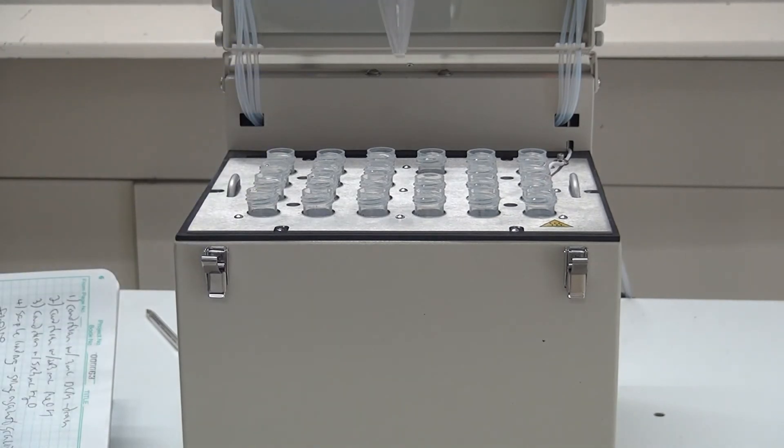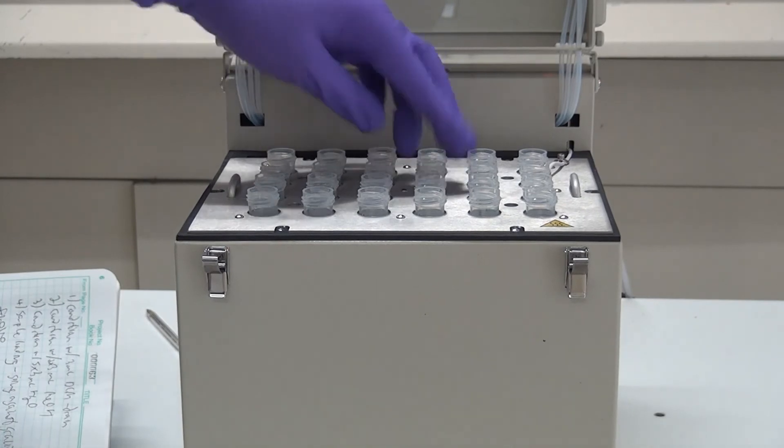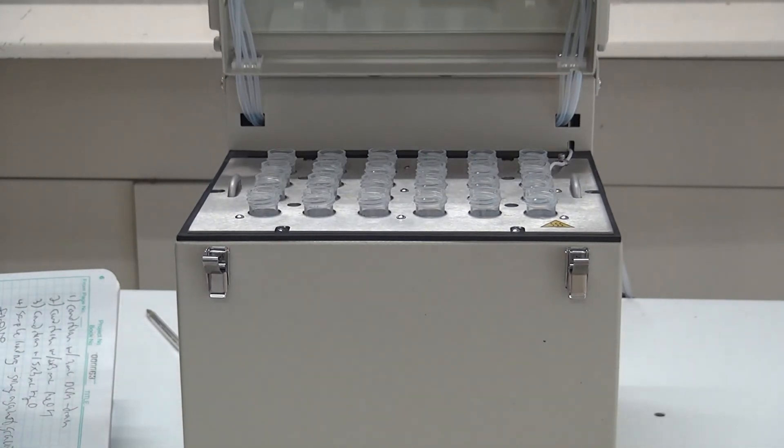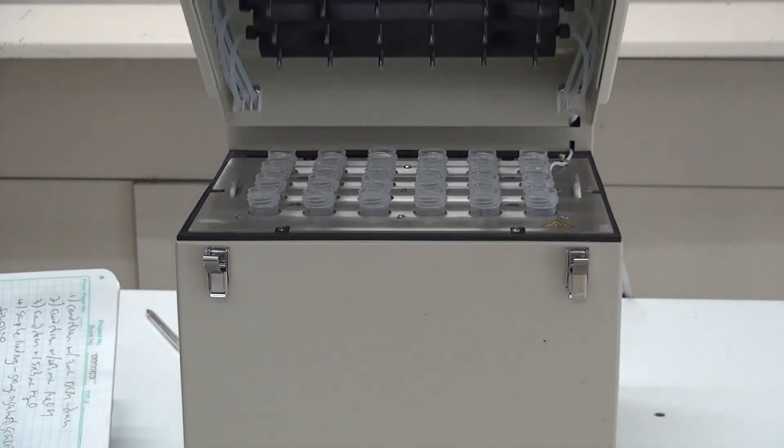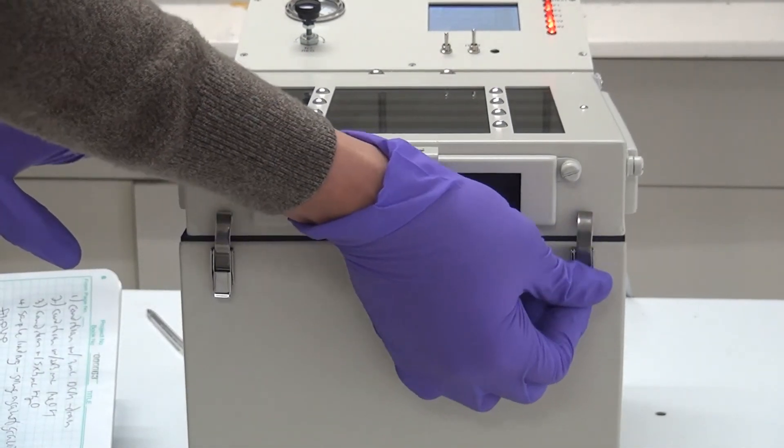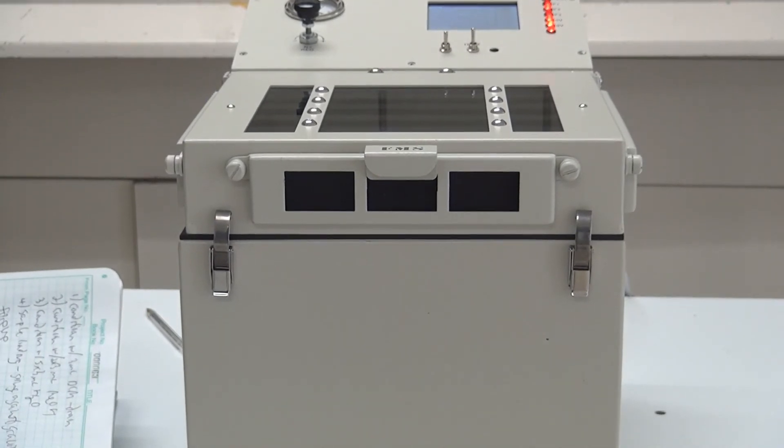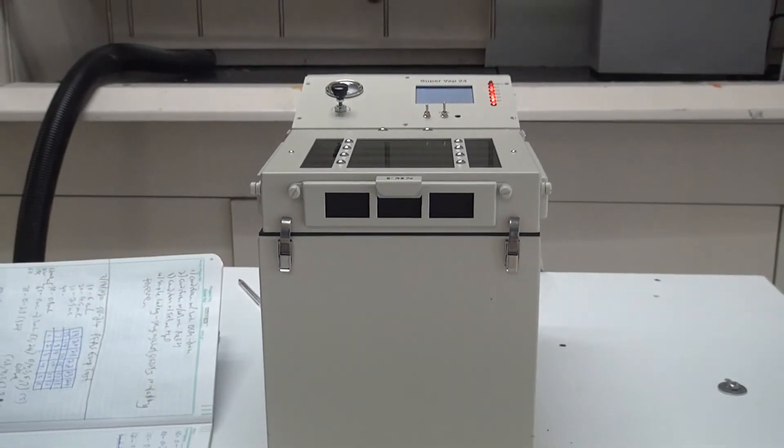Okay so that shows that these are all come to dryness, you can show another one if you like. And there's another one. So yeah it works pretty good. Like I said we set the time for pretty much 60 minutes and then we start to check the vials for the next five or ten minutes to make sure we catch them when they go dry.